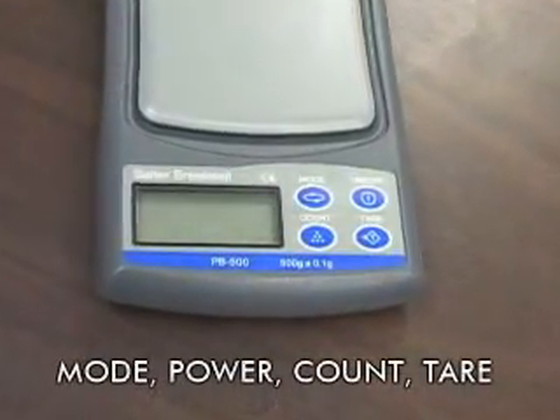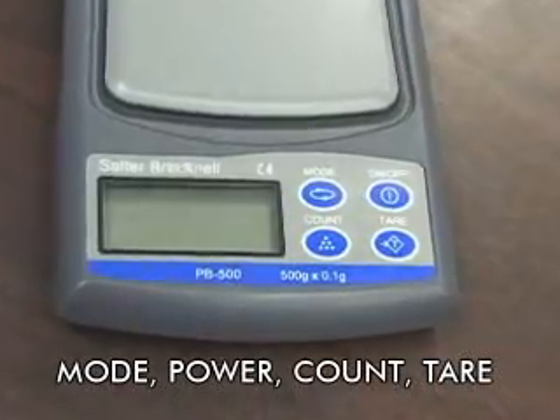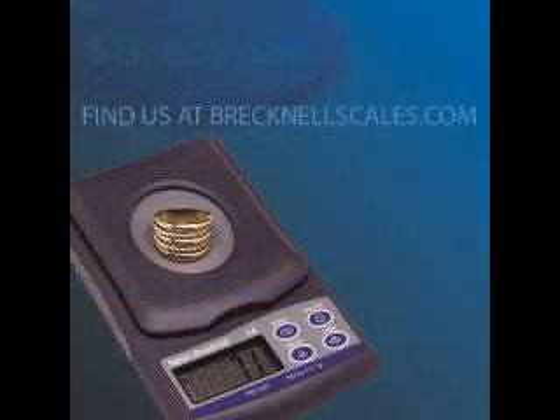Standard features include grams, ounces, pennyweight, and troy ounce weighing modes, parts counting, and an auto power off to enhance battery life.